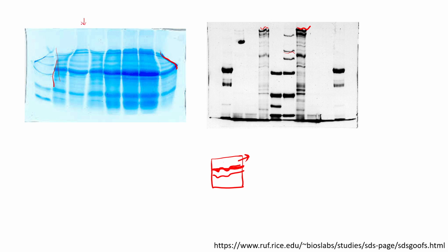If you wait for some time, what will happen? The samples will start diffusing into the gel in any direction because there is no current. When we apply current, the samples move in a straight line. But when there is no current, just after loading, the sample is free to diffuse in any direction. In those cases we get this kind of lateral spreading. This can also happen when your buffer tank is leaking. Whenever we run these SDS gels, we have buffer between two gels and buffer surrounding the gels. If that buffer leaks from any corner, that leak can also cause this spreading.